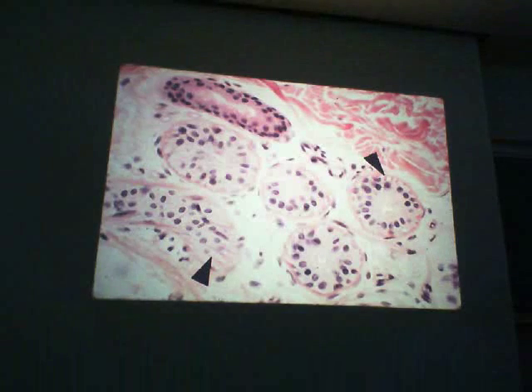Okay, so we have the glandular portion, the duct right there, and this tissue. What is this tissue that we see right in here? Loose connective tissue. And how about this out here? Dense irregular connective tissue. Let's go on to the next slide. Well, let's go back a slide here. These eosinophilic areas you see right there belong to what kind of cell? Myoepithelial cell.